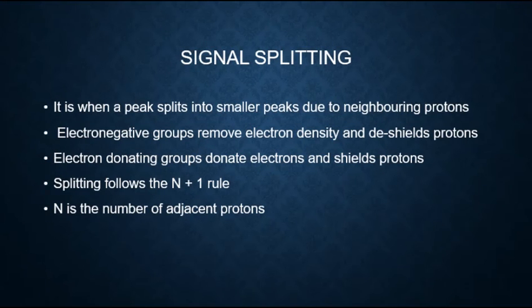The process of signal splitting is an important concept in NMR and gives us vital information about the protons in our molecule. This signal splitting phenomenon is one where we see a proton signal will split into several smaller peaks, all dependent on their hydrogen neighbors.